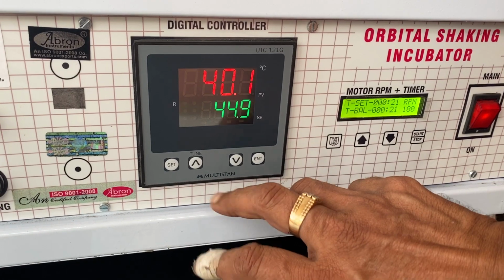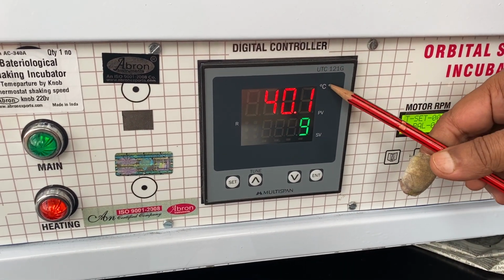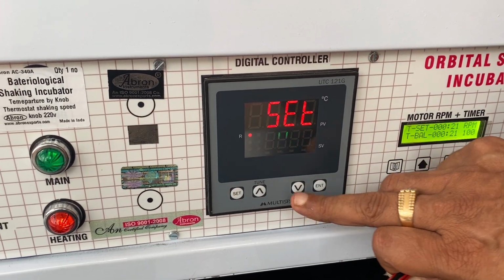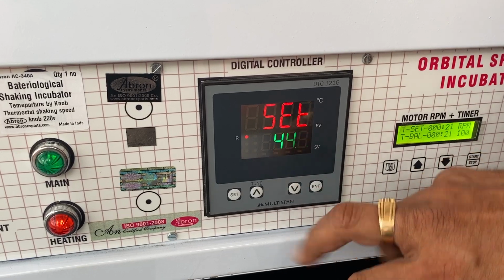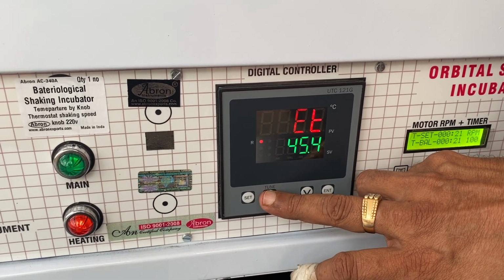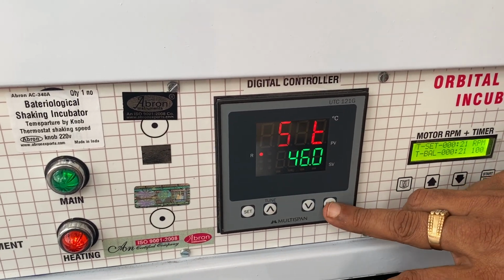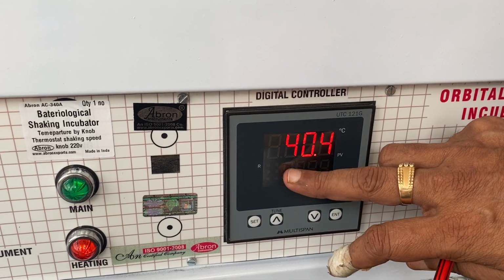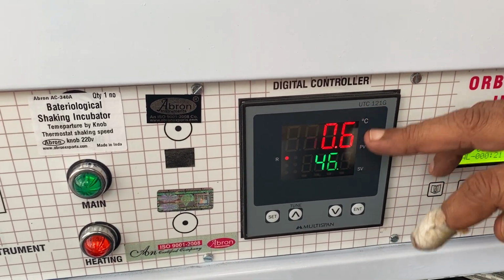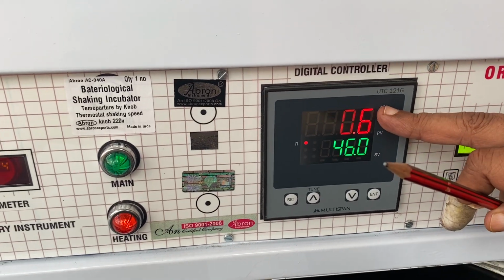And now the temperature setting. This top one tells you the inside temperature. This is the desired temperature. I can set it, increase it, decrease it. Let's make it 50. I can make it 45, 46. I am setting 0.1 degree and then pressing enter. Entering means this is the desired temperature. The fluctuation shows in the video because of the frequency. Now the temperature is coming in.